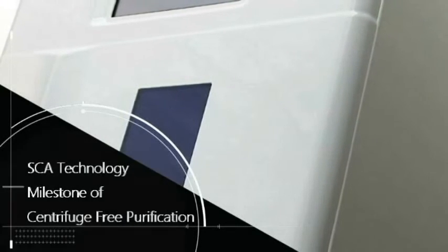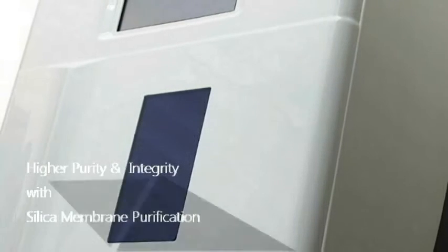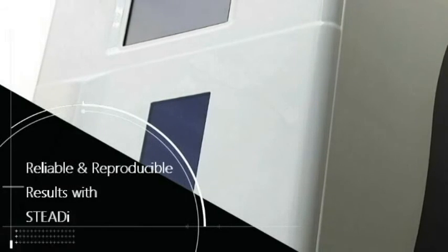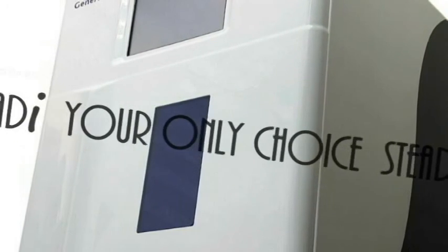With Steady's powerful combination of SCA technology, silica membrane purification, and smart interface, you are guaranteed the reliable and reproducible results of quality you can depend on. Steady, your only choice.